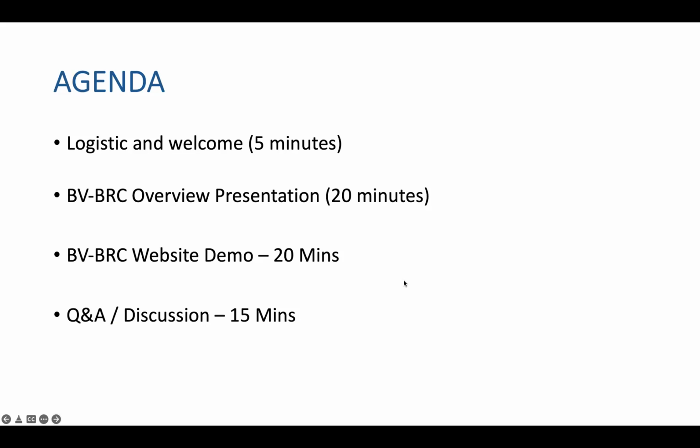So just a quick overview of what the plan is today. I plan to present a few slides about what's new and what's changed, and then we can go over to the website where we can walk through how to find viruses and where to find the services that you need. Then we can leave some time at the end for discussion and any questions that you might have.